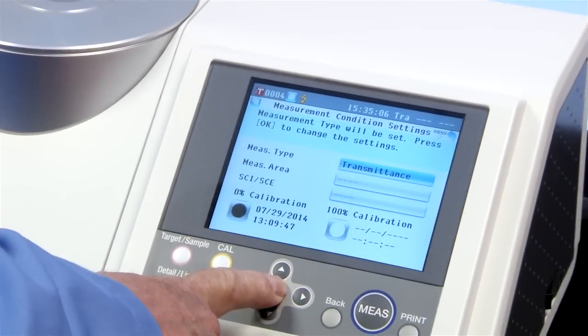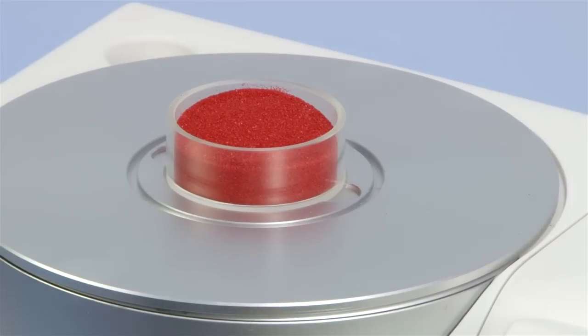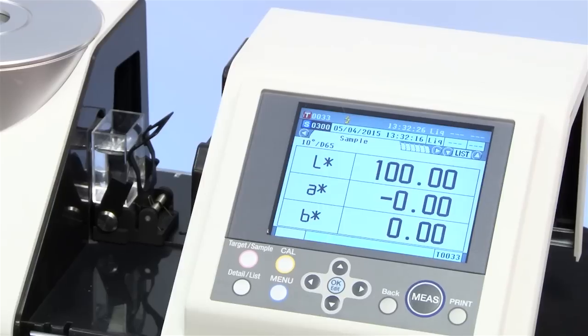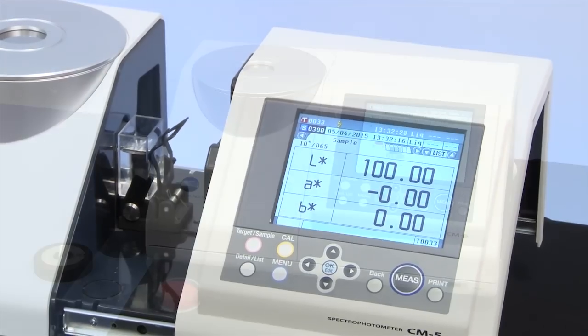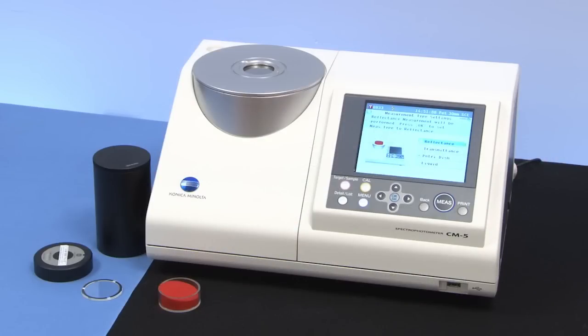Quickly switch various modes in reflectance or transmittance, including petri dish and liquid. Configure the CM5 to your measurement requirements.